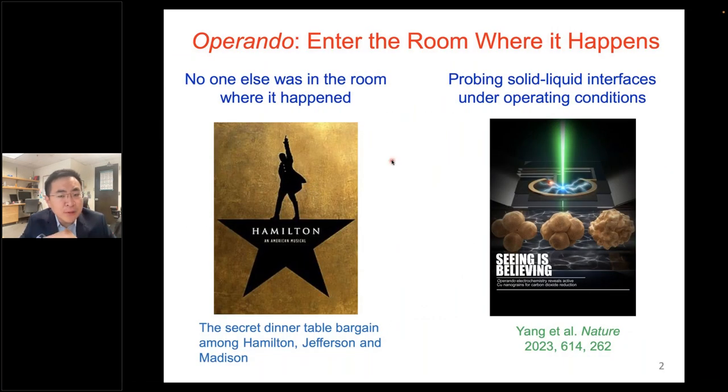My understanding of operando, I would like to borrow from the Broadway show Hamilton. Probably some of you have been to New York City and watched the Broadway show. There was this famous line saying, "No one else was in the room where it happens." For us, we want to enter the room of chemistry and energy materials when it is actually happening. For energy materials and electrocatalysts, it means you want to probe the solid-liquid interface under operating conditions. And here we borrow this line, seeing is believing, from Thomas Fuller, to show you now have a direct chance to visualize the reaction condition, in the sense that we are capturing dynamic movies of the chemical process.